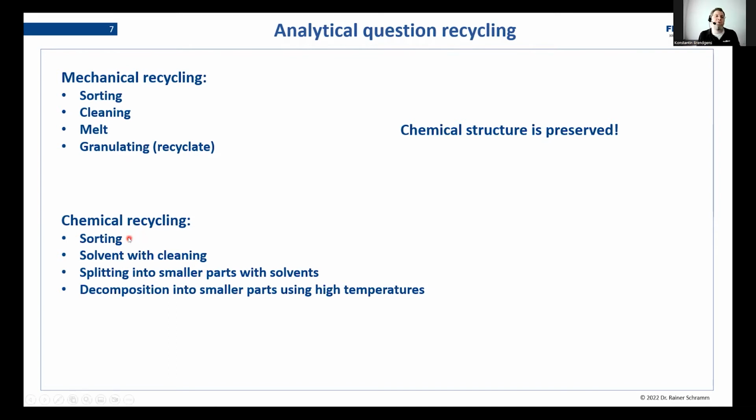Apart from washing, we can also clean it with certain solvents to get rid of a component, or even split one polymer into different ones using solvents or high temperature. This is more for when our goal is to take a mixture of different polymers, split them and remove the ones we don't want.